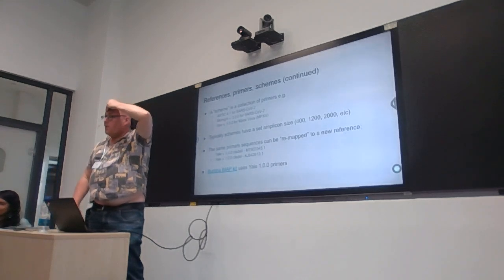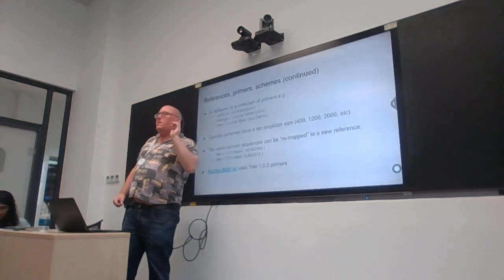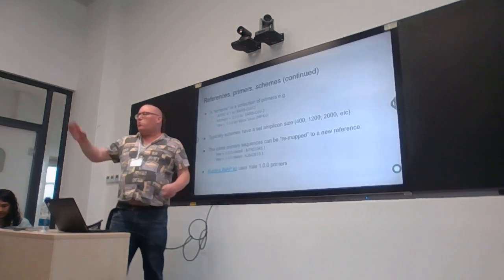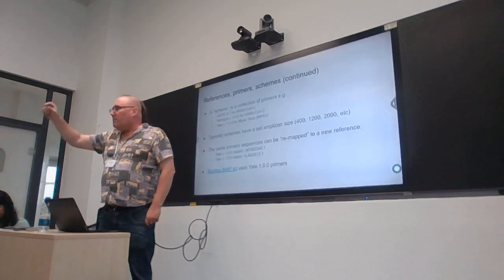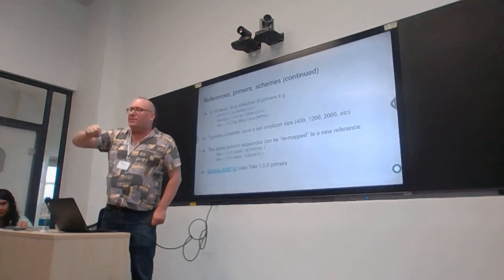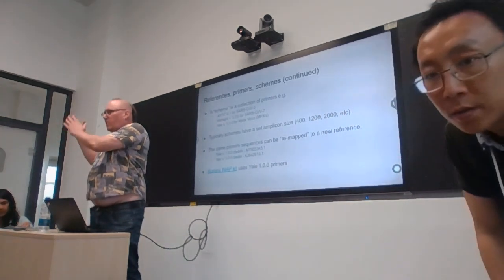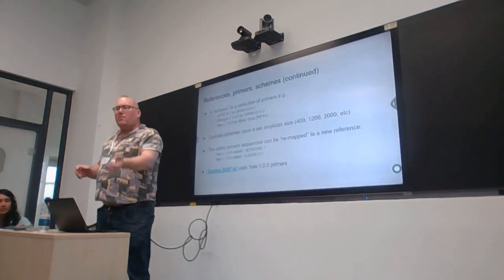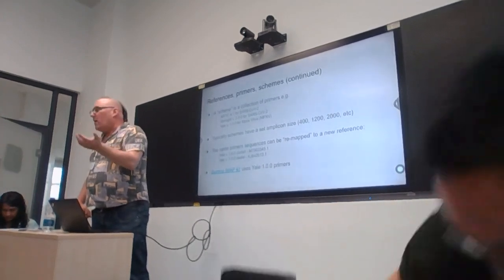Okay. So as I was saying, if we see that it's Yale version 1, that means the actual amplification primers that you use are always the same. But when you're doing the analysis, you are going to be analyzing in terms of clade 1 or in terms of clade 2, right? Because what you're amplifying is the same stuff, since it's the same Yale version 1 primers.